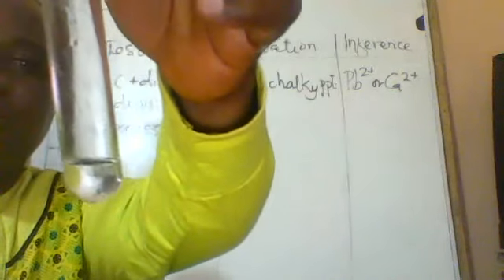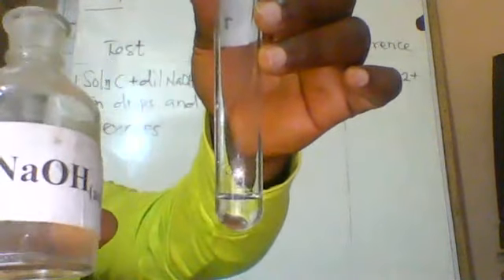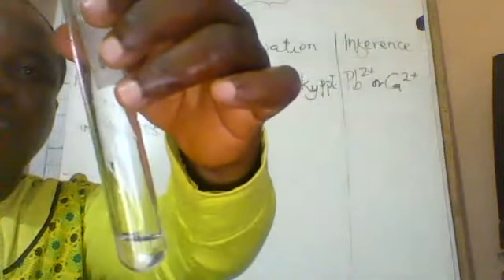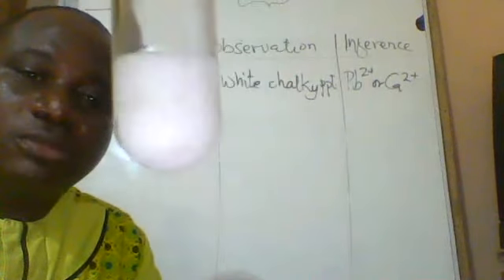Look at this. I'm having my test solution. The reagent here is sodium hydroxide. I'm adding in drops. You see the difference? This one is chalky.